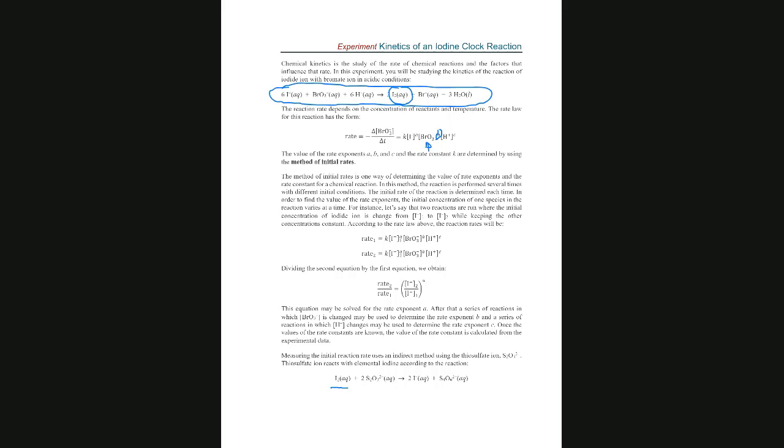And how are we going to use it? We know that iodine forms a dark blue complex with starch. Actually, there is also triiodide, but they both behave the same, so don't get confused with that. Here they want to talk about the triiodide, but consider that it is iodine, so we don't add one more point of confusion.